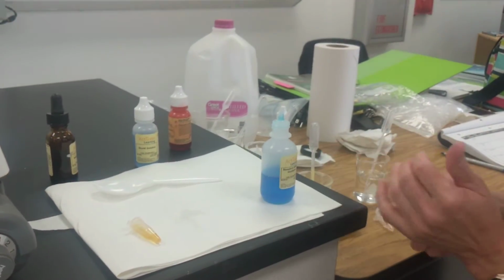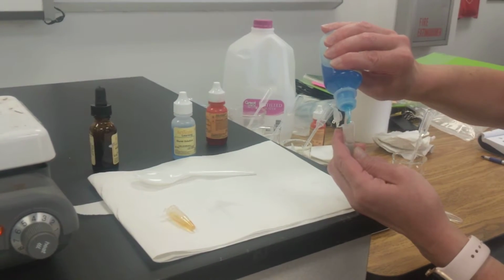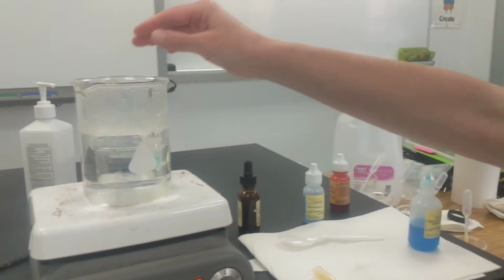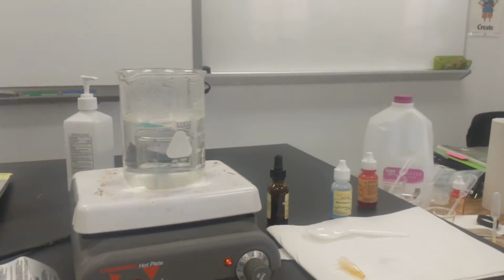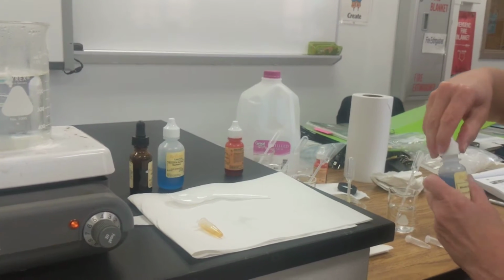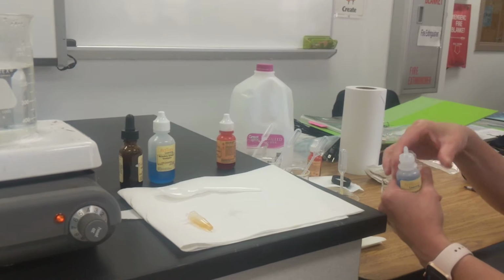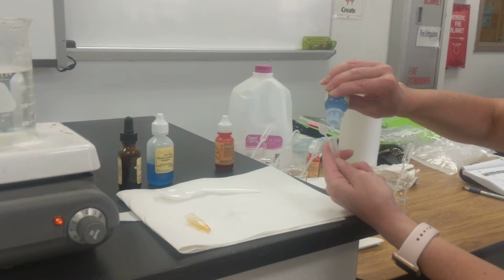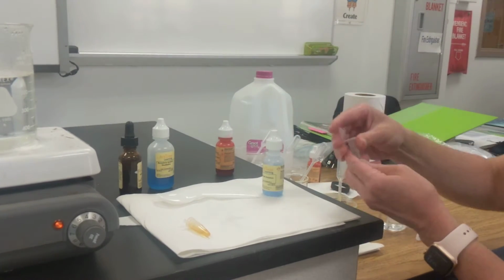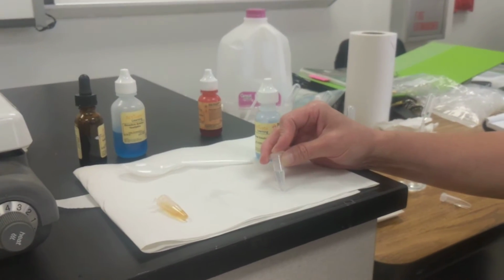The next is our Benedict solution, so we're testing for sugar. Shake that up, we'll put it in our hot water bath, let it sit in there for a couple of minutes. While it does that, I'm going to open up the Biuret solution. We're going to be testing for protein. See if there's any in there. All right, it's still looking pretty clear, pretty light blue on that.